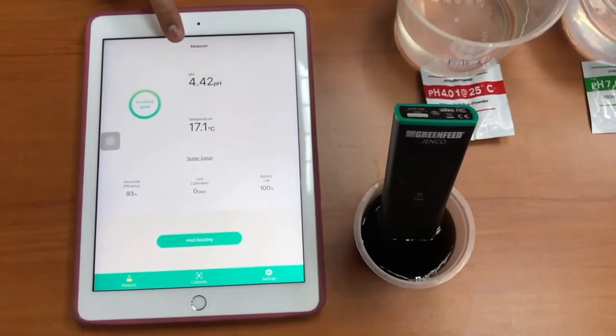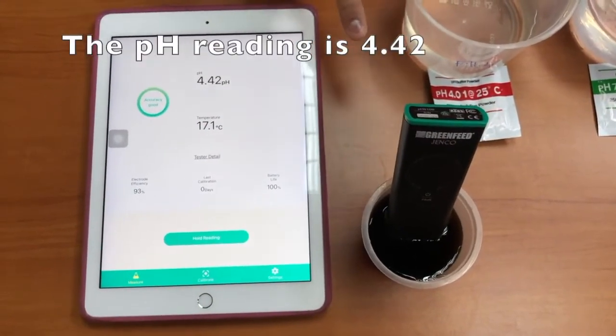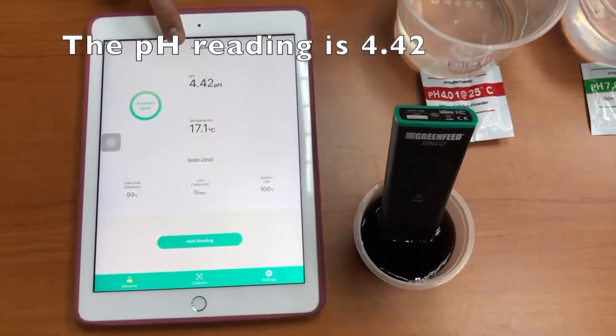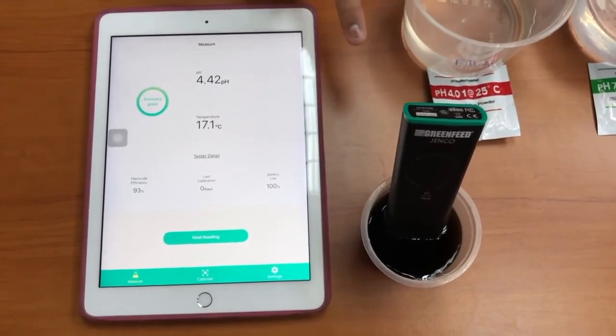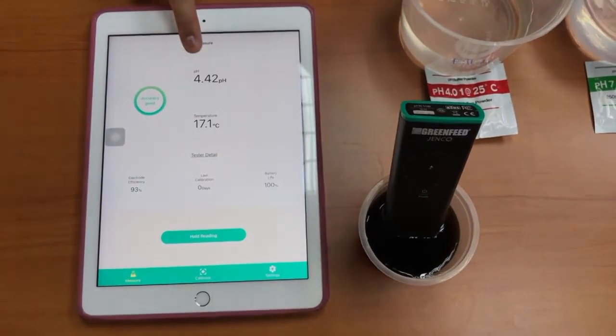After the reading is stable, we can see that the pH of the solution is 4.42. You can see that this solution is quite acidic. That's all from us, thank you.